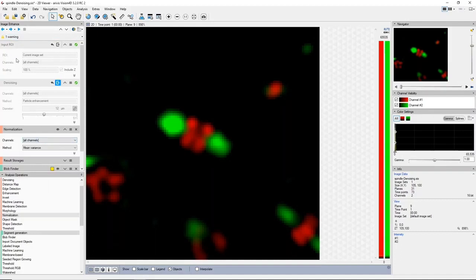So I'm really thrilled about this as well. You can see little things really please me. I do believe there's a saying that little things please little minds. But you know, in these isolation times, it's great to have these features.